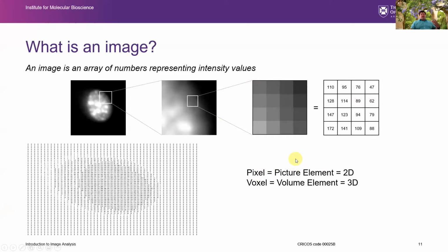But when we're doing 3D visualization especially, and when we capture data on the microscopes, there is volume information with each slice that we take, and we refer to the 3D pixel as a voxel, or volume element. And in a classic fluorescence microscope image, if we look at it in its numbers form in a spreadsheet, you can see that all these background values are quite low, and that's the black values, and the object in the foreground, the nuclei, will have these higher values.